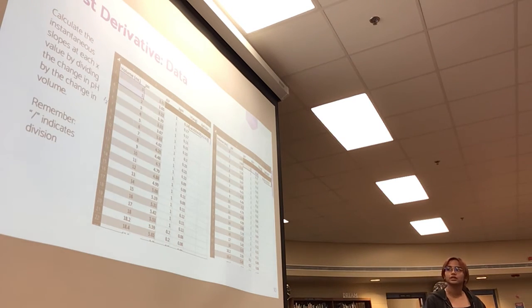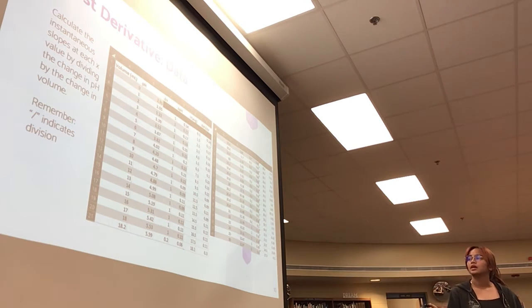Hit enter, and then this is what it should be after you've copied your formatting. And this is your first derivative data.